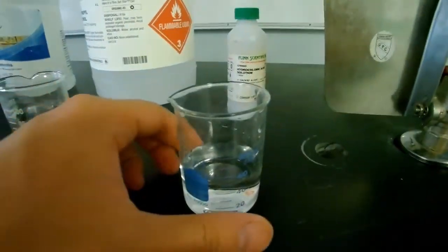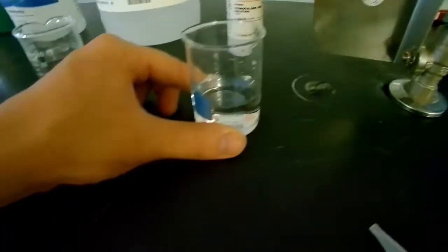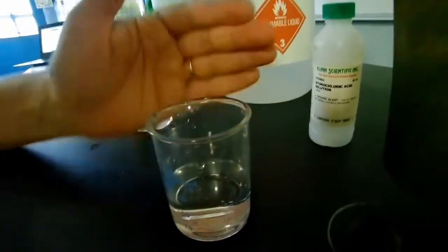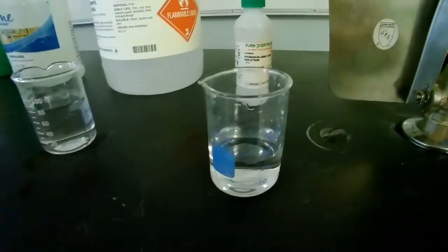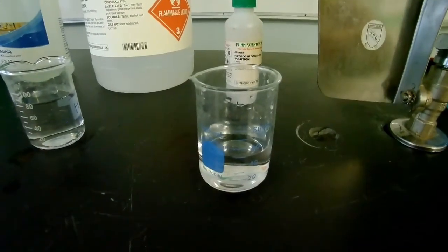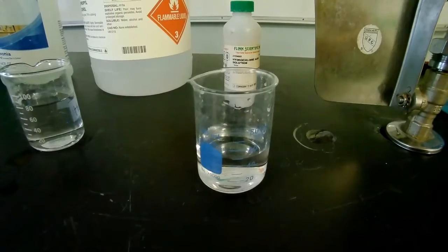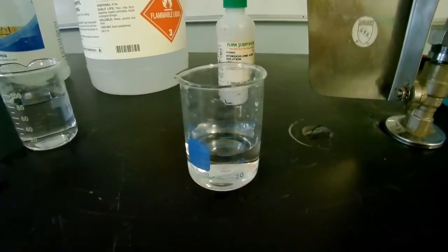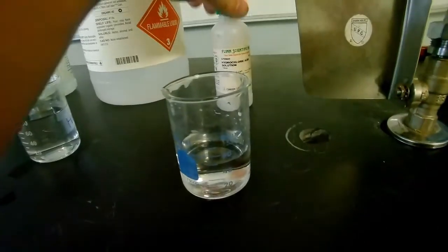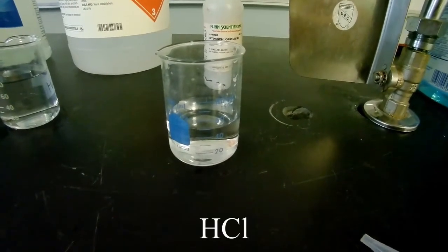So that's the appearance, the smell of it. It has a slight, I would just say burning sensation when you smell it, so I'm going to waft this one. Yeah, slight burning sensation when you smell it, otherwise no other smell. I think it's pretty clear if this one's an acid or a base, based on the fact that it's called hydrochloric acid. But as a fun fact, this is the same kind of acid that you have in your stomach. And, oh, look at that warning. Corrosive to body tissue. Yes. You don't want to get this stuff on you. And the chemical formula for this one is HCl.